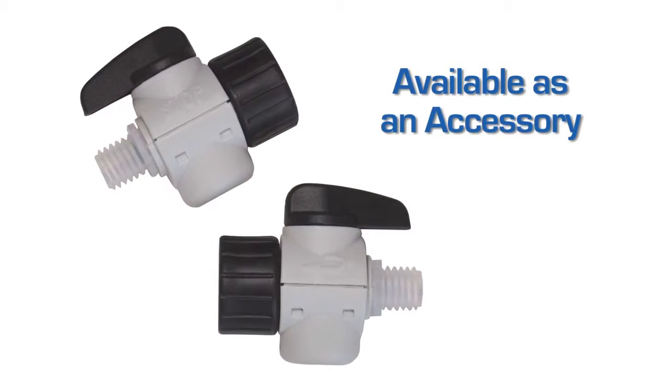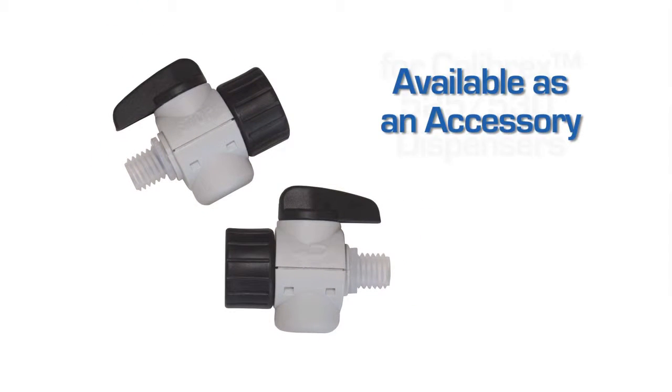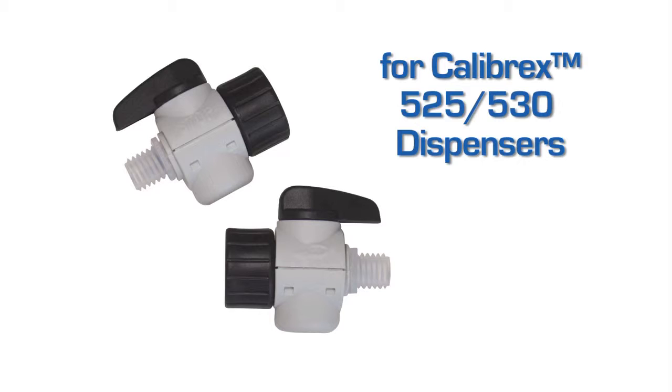The stopcock is available as an accessory and can be mounted anytime on Calibrex 525 and 530 dispensers.